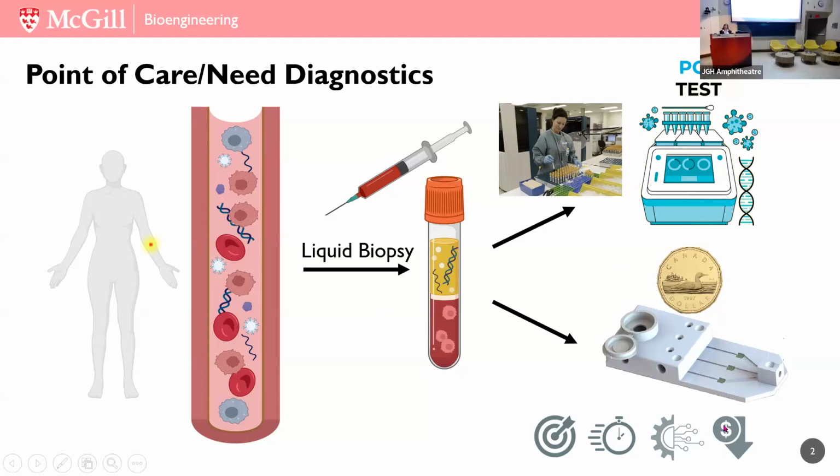And potentially we can also reduce the price of these devices by bringing engineering approaches and automation approaches. These kinds of devices are what we call microfluidic or miniaturized devices that can combine all these keywords and elements.